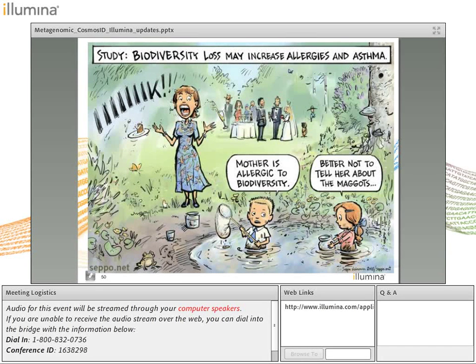Good. And then another one is, what is the most key point for high-quality metagenomic sequencing? The answer is DNA quality. Definitely, DNA quality is important to put into the sequencer. That's definitely one thing. And so following the workflow that I described definitely helped.